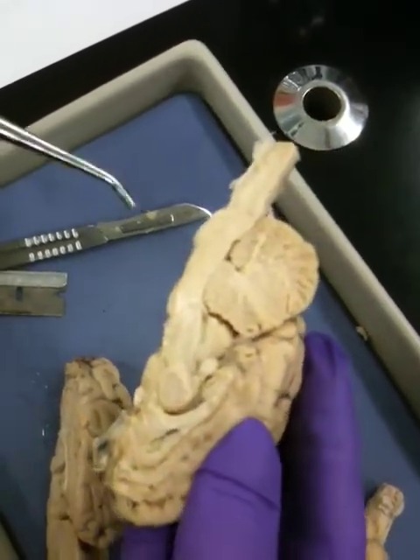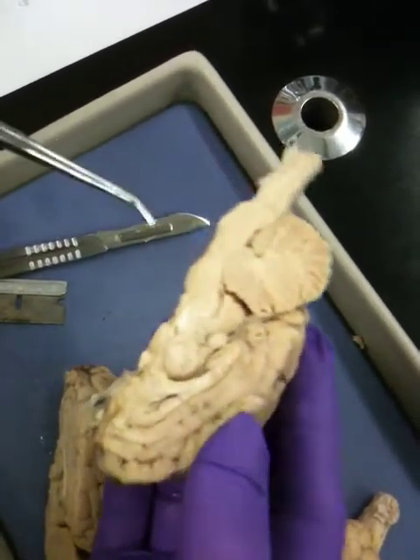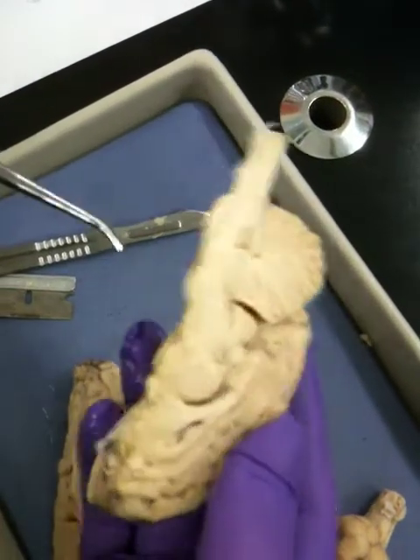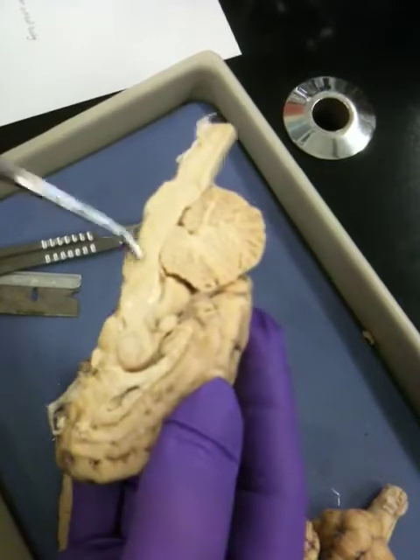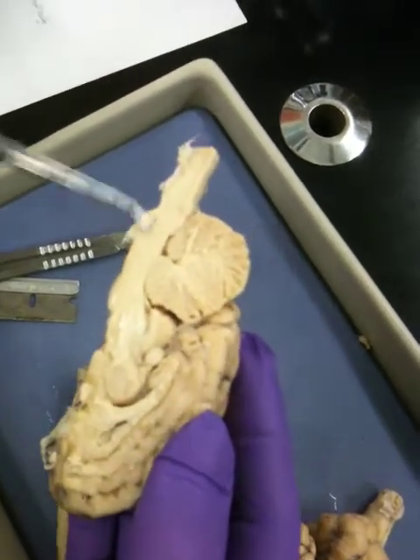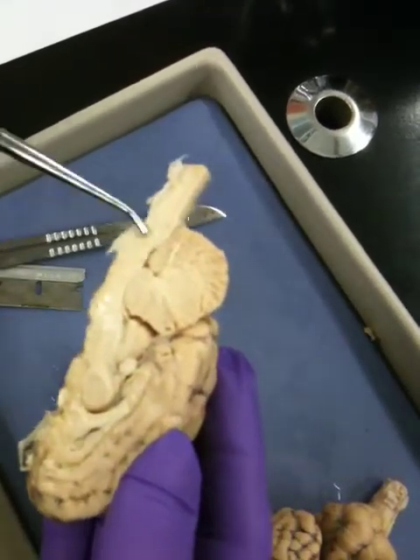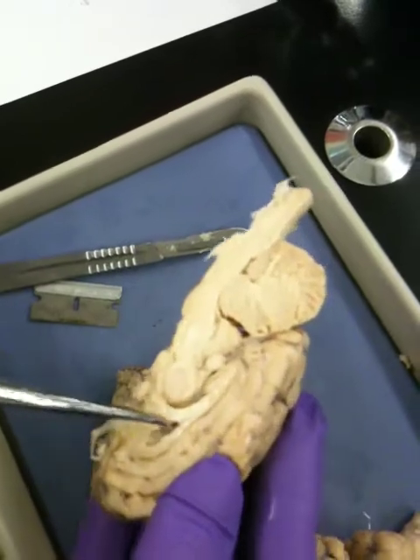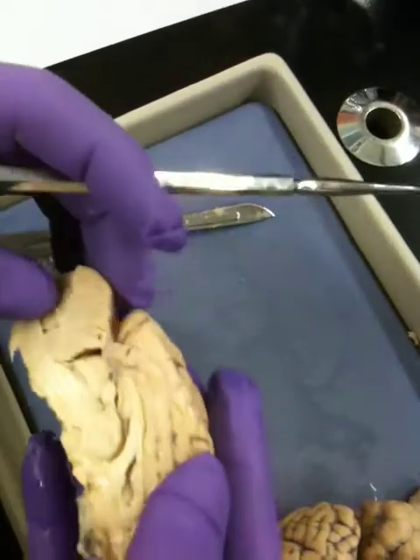And then the pons and medulla oblongata, you can actually see those two structures here. Up higher, this area is called the pons, and the medulla oblongata is here. Collectively, these two are extremely important structures of the brainstem. They do a lot of important things, and hopefully you'll learn about them in your lecture. So, let's see what else.